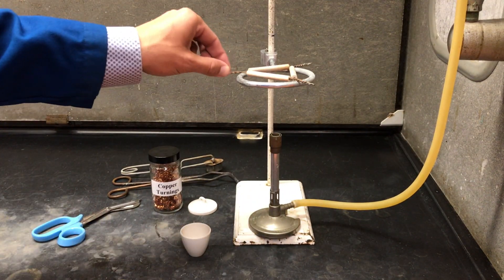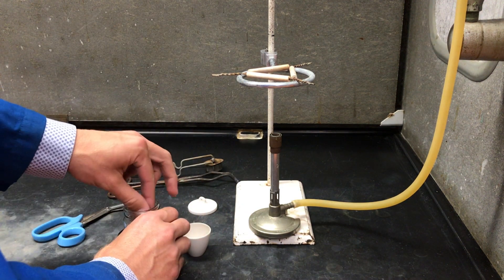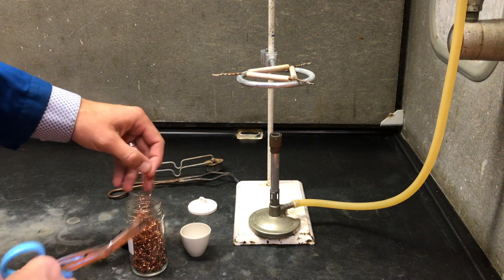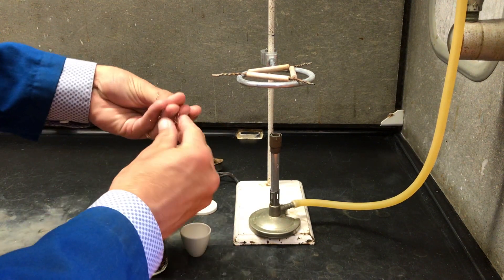In this reaction, we're going to be heating solid copper metal in a crucible, reacting it with gaseous oxygen. Put enough copper metal to cover the bottom of the crucible.